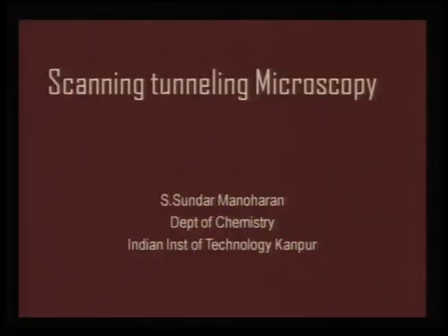In the microscopy techniques we will be specially looking at the range of methods that are available which can be mapped under microscopy, namely scanning electron microscopy, transmission electron microscopy, scanning tunneling microscopy and atomic force microscopy. All these are basically imaging techniques. They are quite different from the spectroscopic tools, but it is impossible to cover all this in one lecture.